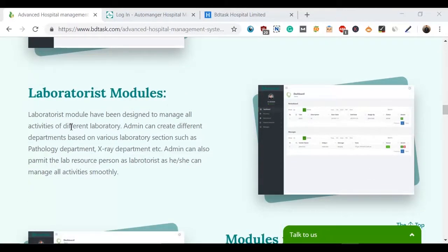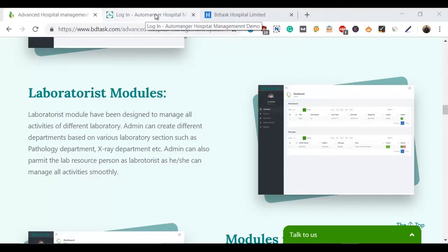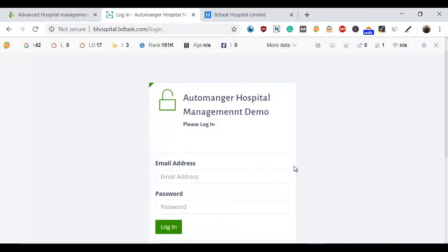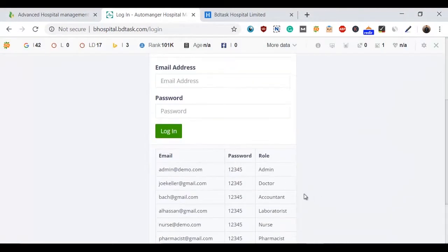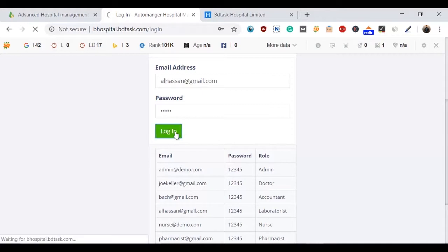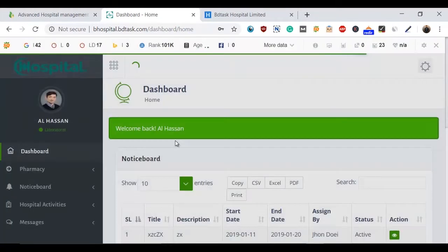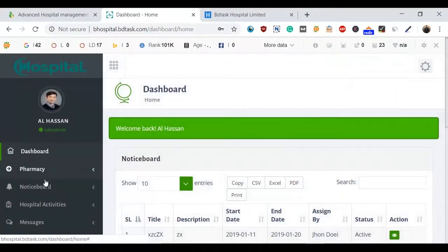Now we're going to see the module in full feature, so let's go and log in. I'm clicking the role of Laboratorist and logging in. Here is the dashboard. I can see the left sidebar with pharmacy, notice board, hospital activities, and messages.